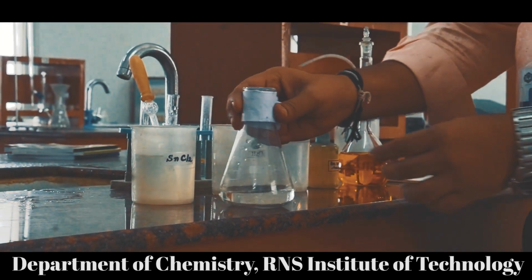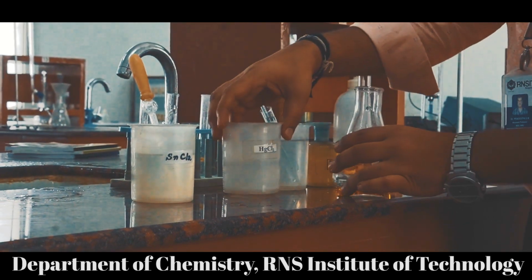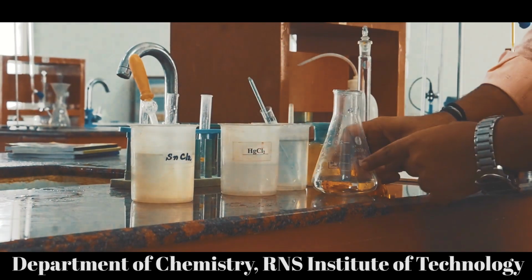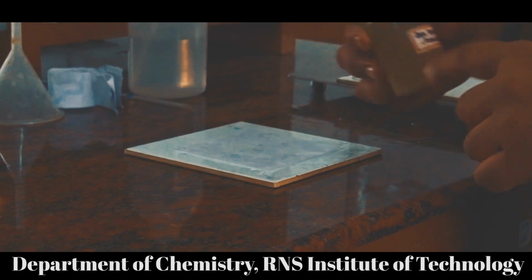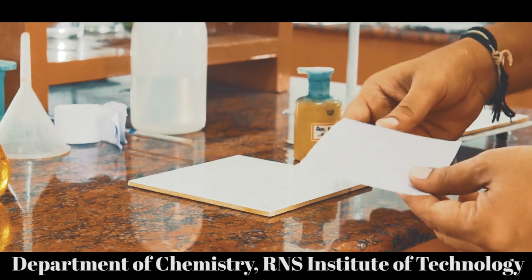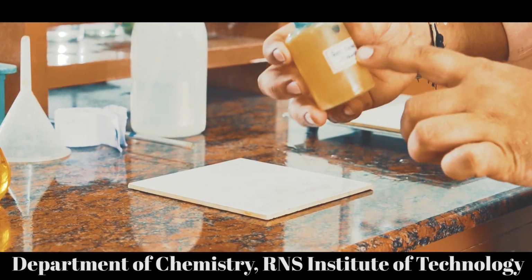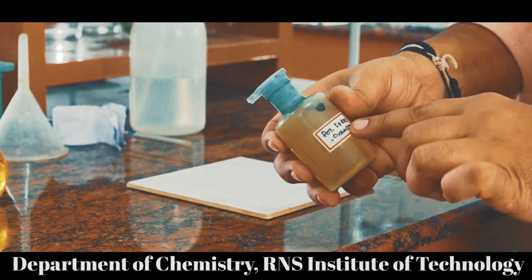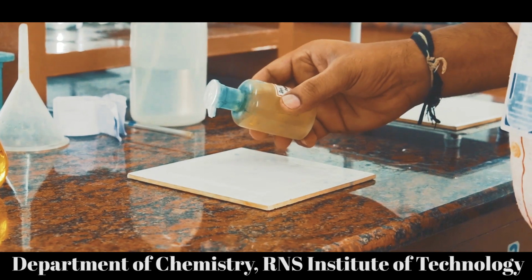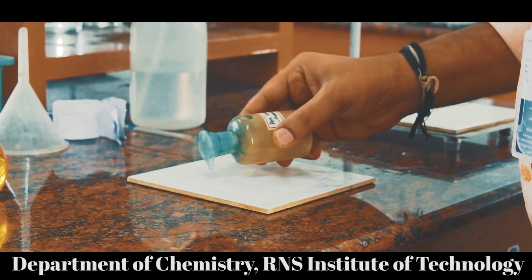After this you need to add quarter test tube of mercury chloride in order to destroy excess stannous chloride which we have added. So we need to take a wax paper, and it should be cleaned, washed with the distilled water, and you have to place it on this white tile like this. Then you have to take the indicator droplets. Here the indicator, as already mentioned, is potassium ferricyanide. Place indicator droplets on this wax paper, just like this. Okay, so take a few drops.